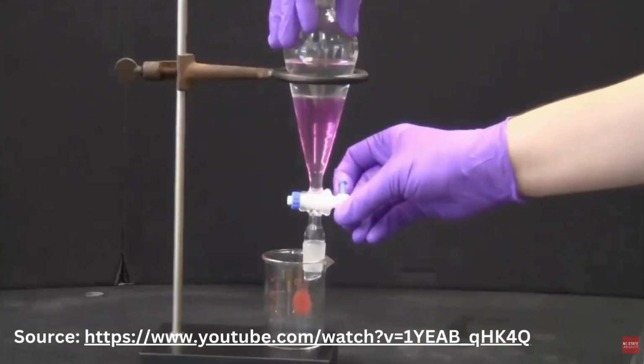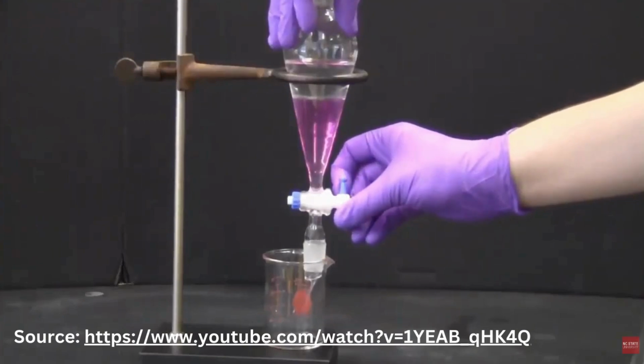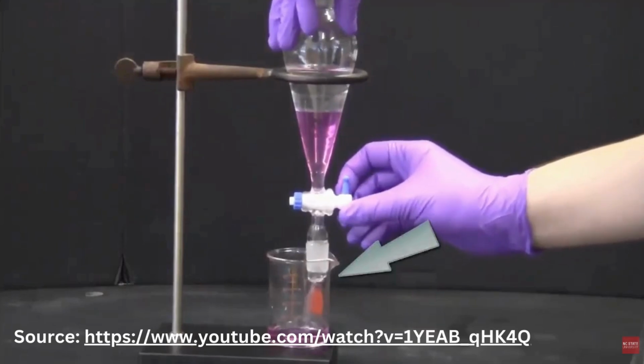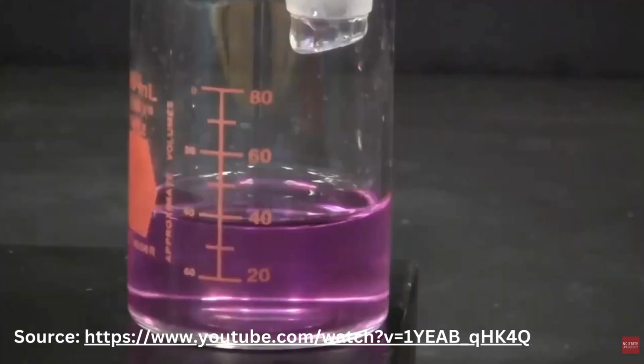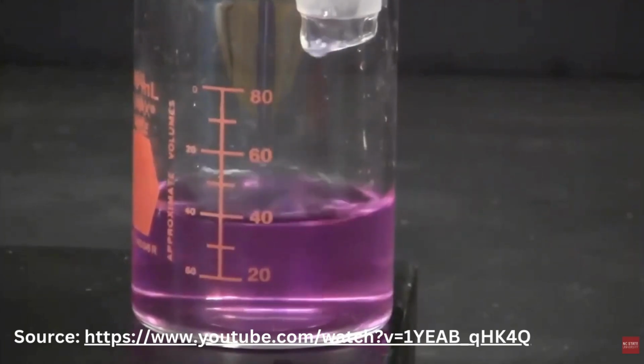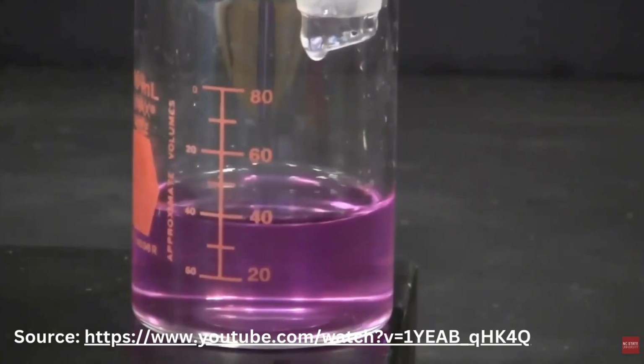Next, transfer the lower layer into a beaker by slowly opening the stopcock, placing the end of the tube at the beaker to avoid splashing. At the end, carefully control the flow of the lower layer to avoid the upper layer solution flowing into the beaker.